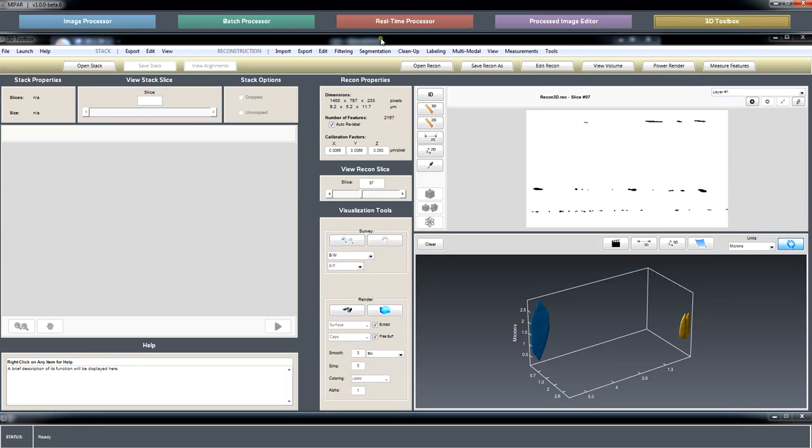The recipe store is in development, and we're trying to decide exactly how to roll that out. We really want to make that an open repository for all to use and contribute to. And Beta 7, which will include a lot of suggestions made here today, as well as a whole list of other feature requests and many bug fixes. I expect that to be out certainly in the next 2 weeks.